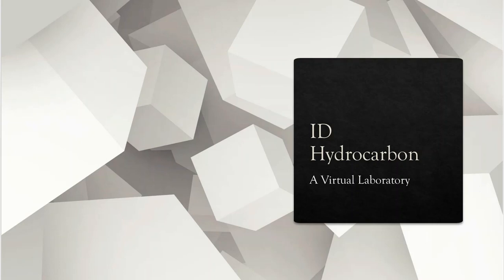Welcome to the laboratory on the identification of a hydrocarbon. If you've made it to this point, guess what, folks? You've already sat through the pre-lab videos and you know what to expect. So let's get right to it, shall we?